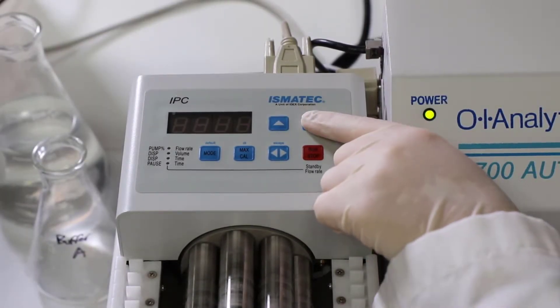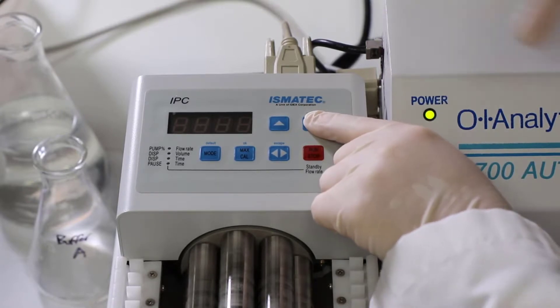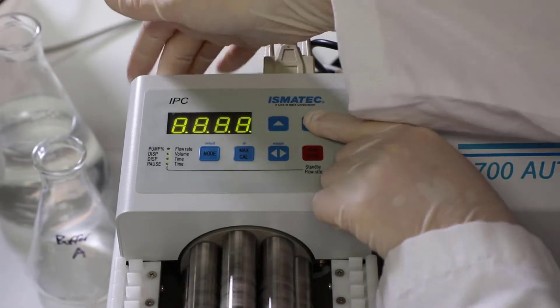To program the pump, you're first going to hit the settings button and hold it, and while you're holding it, you're going to flip on the power button in the back.